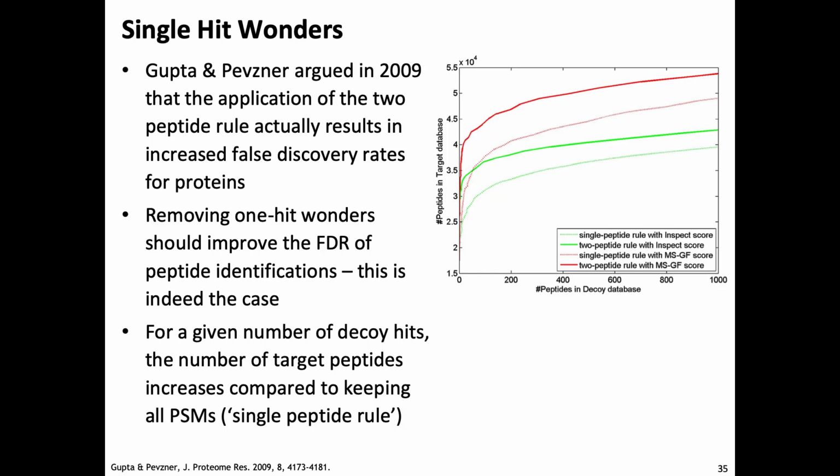And it took people a while to realize that. They thought, yeah, I just measure more and more. I do triplicates, quadruplicates, even more than that. And they always got, of course, a higher number of identified proteins, but not after FDR correction. Then this number actually goes down because you have to account for all these incorrect hits.